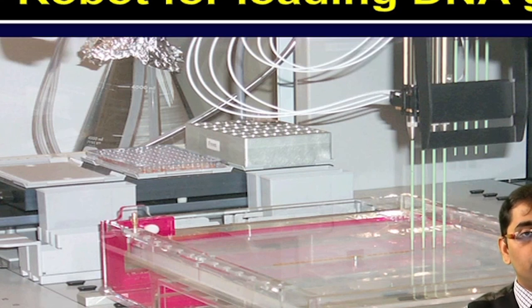If you are doing this manually, it will require large amount of time, as well as there will be sample spilling on the gel along with various other manual errors in loading, including the gel assembly and gel loading. Also, by the time you start from the first sample and reach to the last one, many samples are likely to be diffused. So, automation as well as speed are very important.